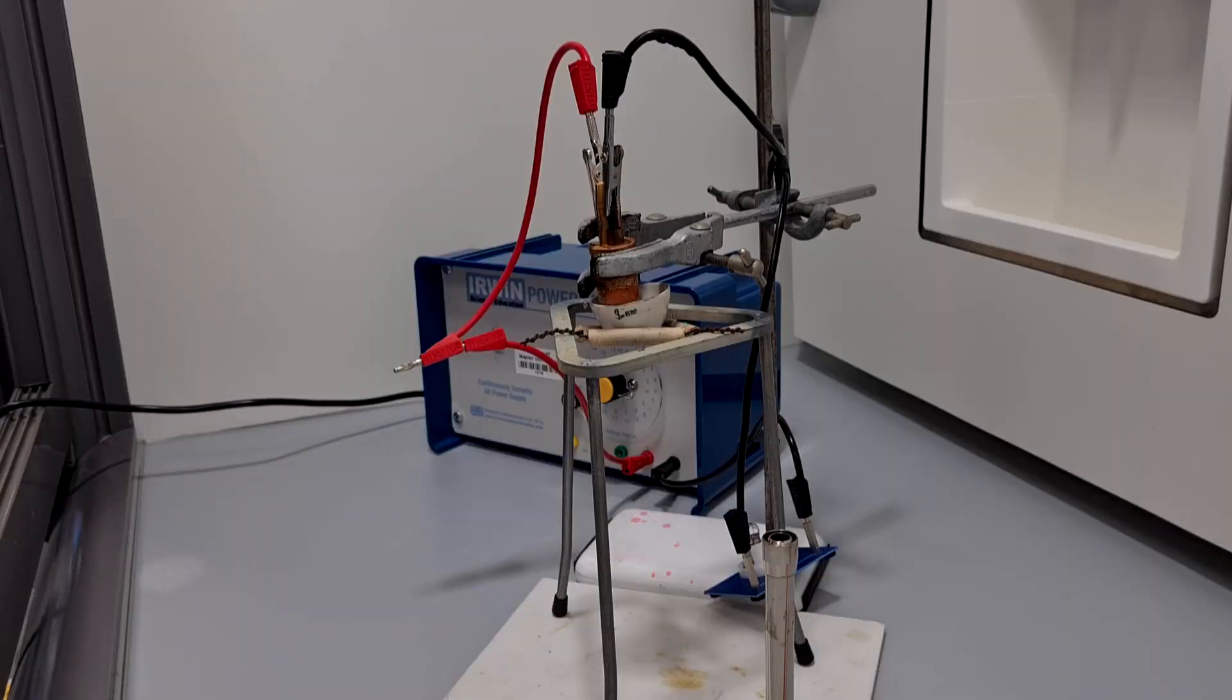And you can see now that as the zinc chloride has turned from a liquid back into a solid as it's cooled down, that the light bulb has gone back out again, showing that the ionic solid is not conducting electricity.